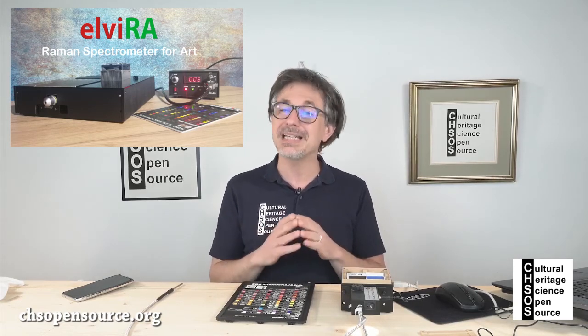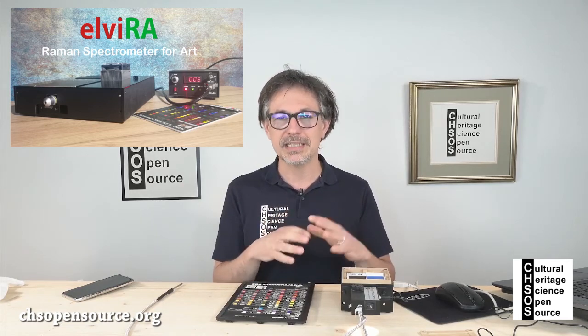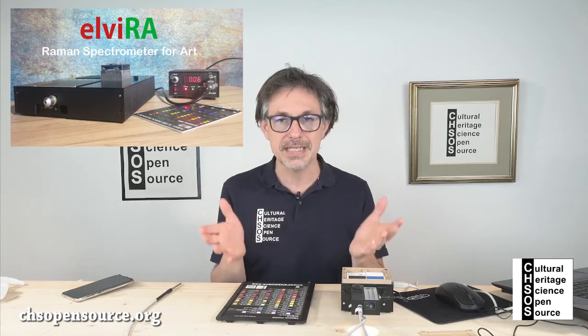Raman spectroscopy is more powerful, but definitely the instrument is more delicate and requires more time for the acquisition. But it's nice, as I always say, to complete your analysis with more tools to have more confirmation of the actual data.